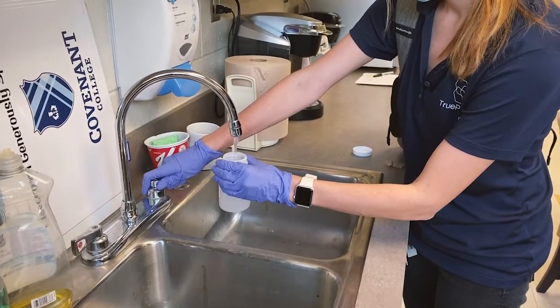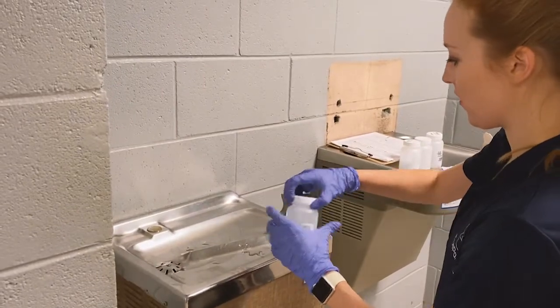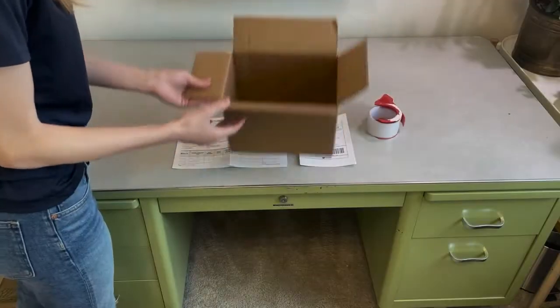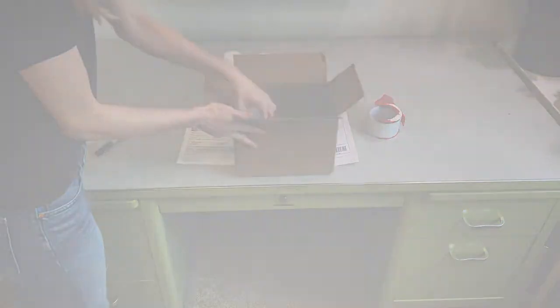Once the sample has been collected, you can dispose of the bag and sign and allow others to resume normal use of the sink or drinking fountain. Repeat this process to collect one sample at every outlet. After you've completed all samples, follow the instructions from your laboratory provider to properly pack the samples and return them to the lab for analysis.